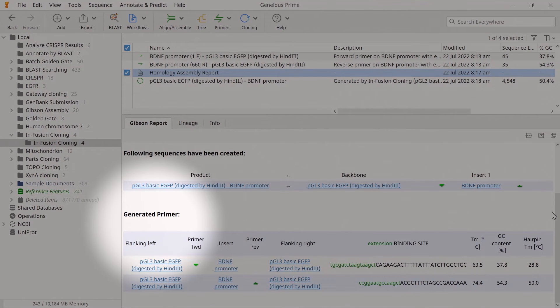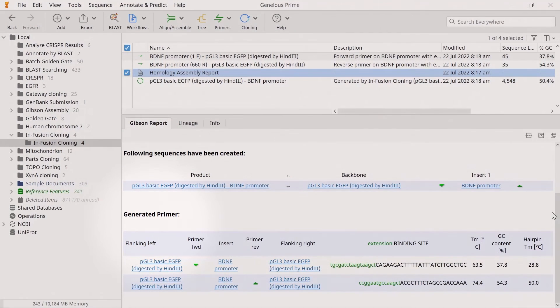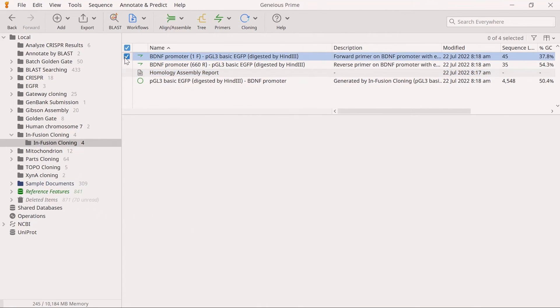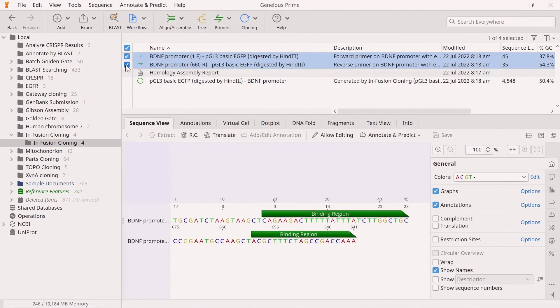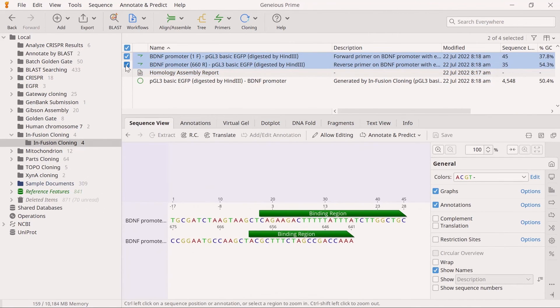The document table also lists each primer created by the simulation as separate files.